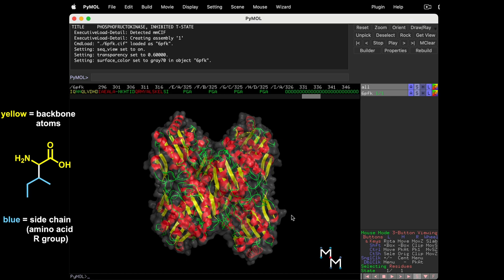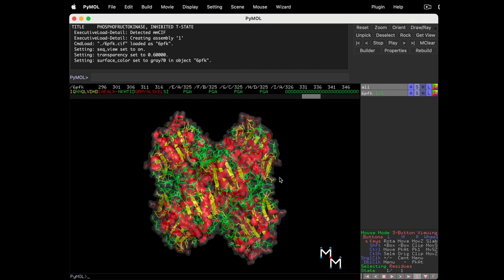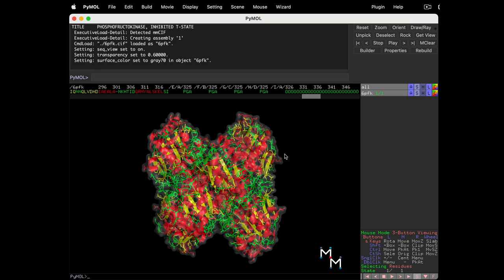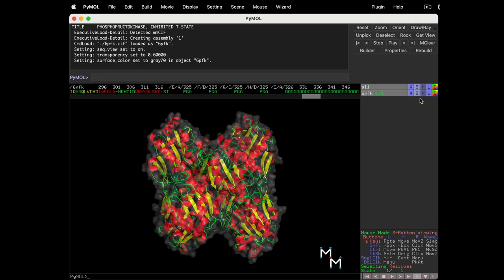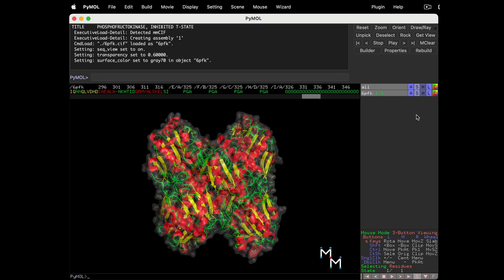Let's add these side chains. Show, side chains, sticks. And we can now see how these fit into the surface. The sticks are kind of thick, and the rendering is looking much too busy. So let's hide the sticks.